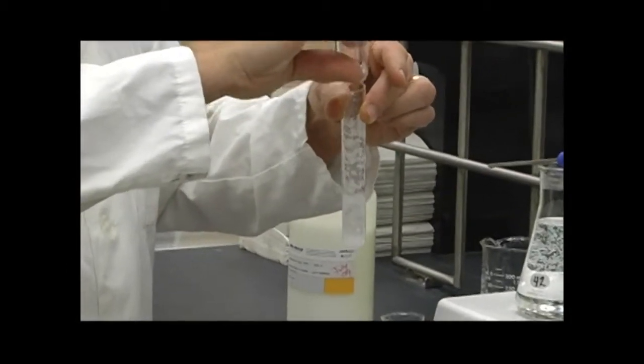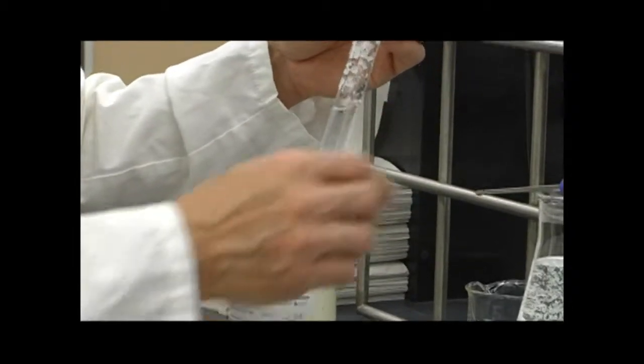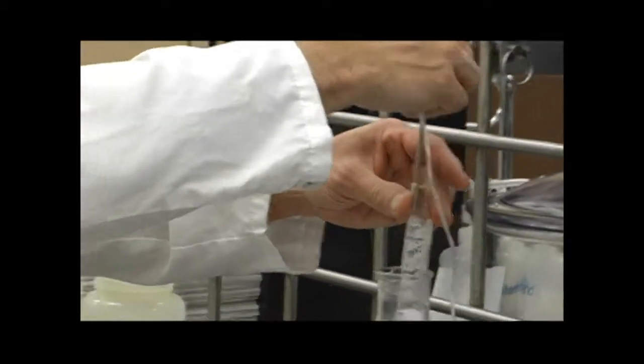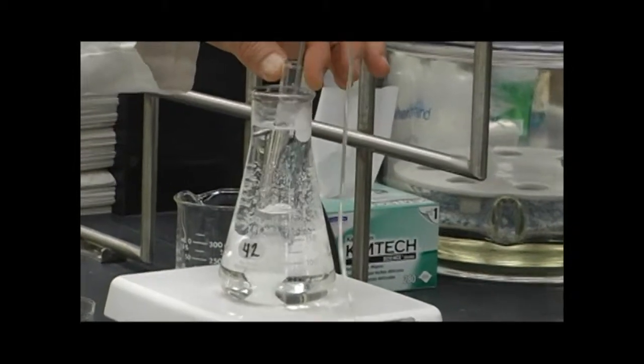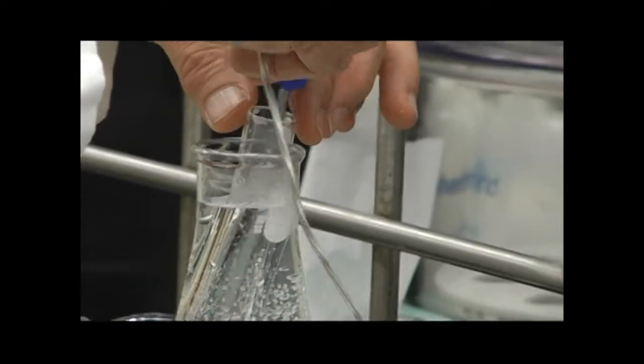Okay. Some stuck on the sides. Try to get it all into intimate contact with the lauric acid. Maybe the heat will let it slide down.